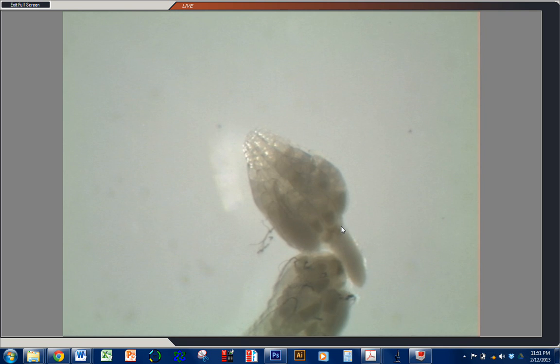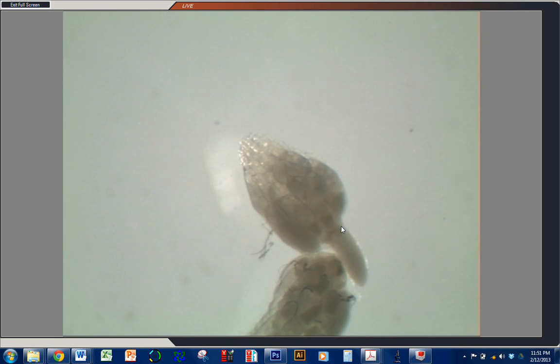And so that's how you dissect these ovaries. If you're going to use them for immunohistochemistry, what you'll need to do is use a needle and tease apart the individual ovarials. But for this case, we're just going to throw them into sample buffer, boil them, and run them on an SDS-PAGE gel.